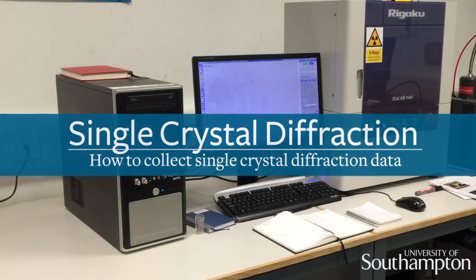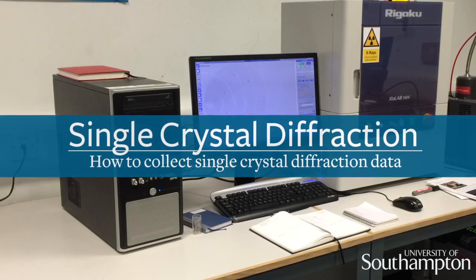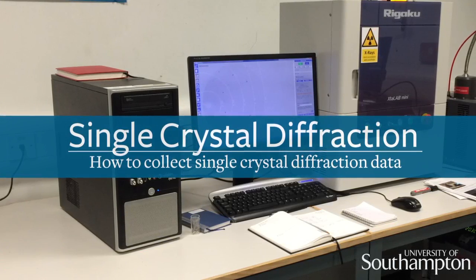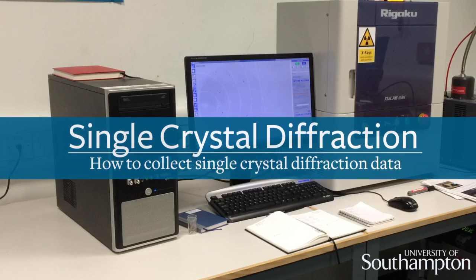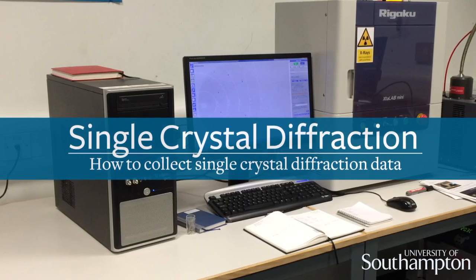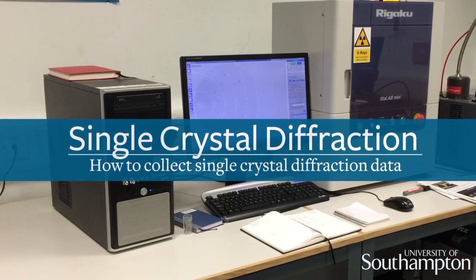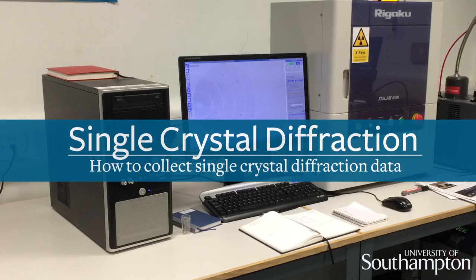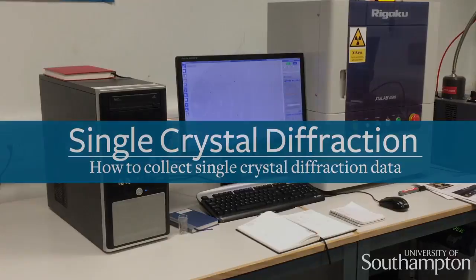From a single crystal X-ray diffraction experiment, one can obtain the three-dimensional structure of a particular chemical compound. In other words, see the bond connectivity and spatial arrangement of atoms that make a particular crystalline substance. This type of experiment requires a perfect single crystal of a substance, which is then mounted onto an X-ray diffractometer to record X-ray images from which the crystal structure can be determined.